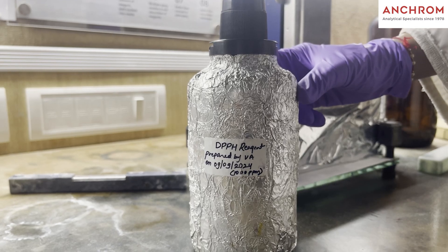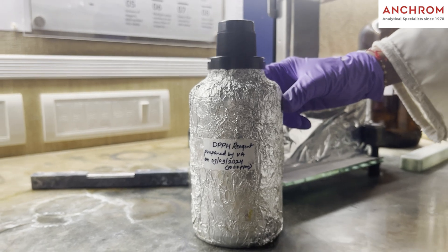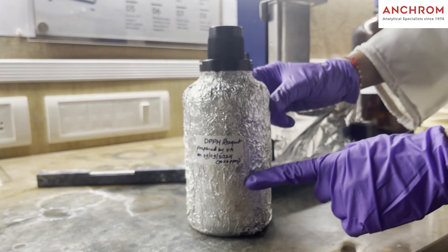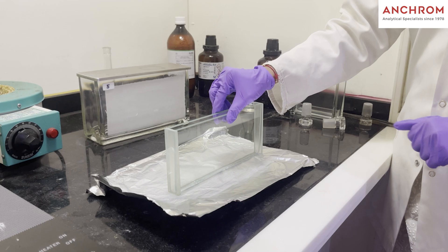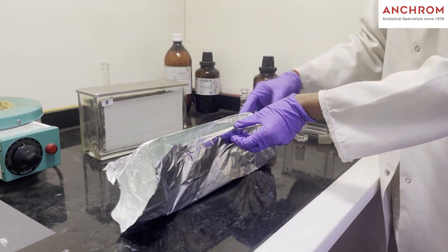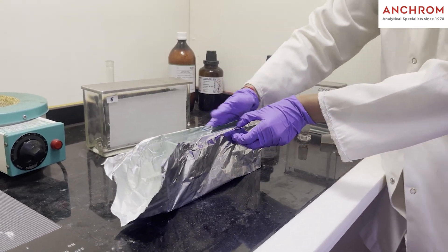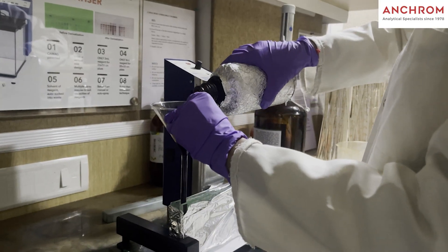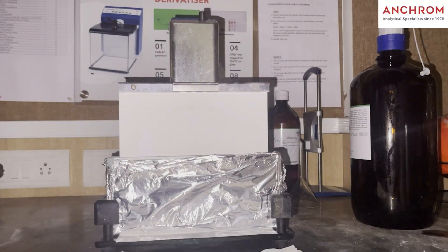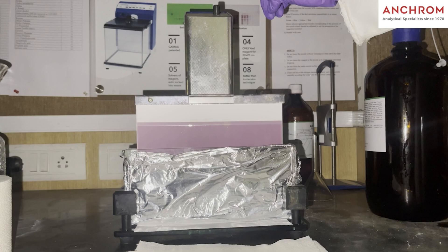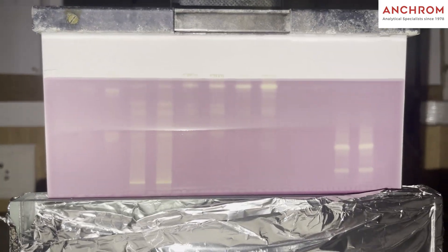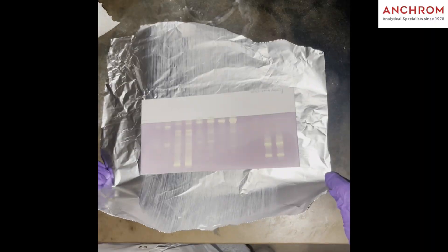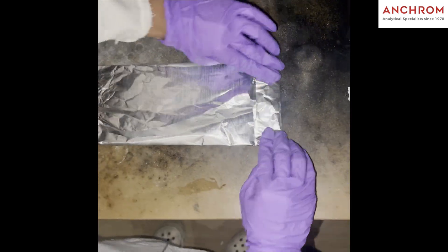For assessing the antioxidant activity of the samples, dip the plate in 200 ml of DPPH reagent. Before dipping the plate into the immersion device, ensure that the chamber is covered with aluminum foil and turn off the lights as DPPH is a photosensitive reagent. After dipping, dry the plate to drip off the excess reagent and cover the plate with aluminum foil and keep it in dark for 1-2 minutes to complete the reaction.